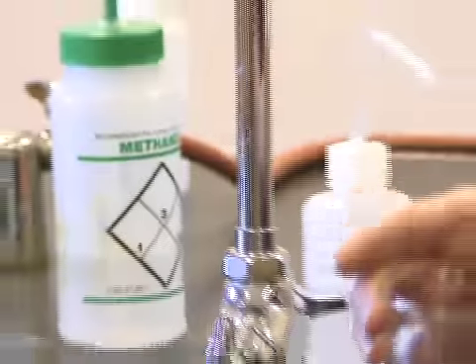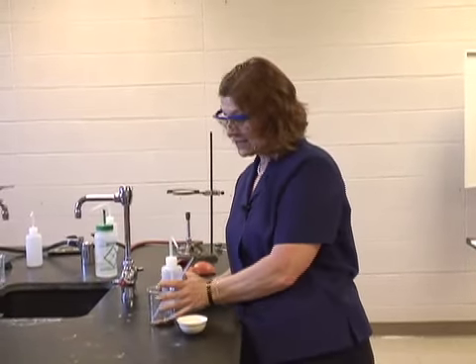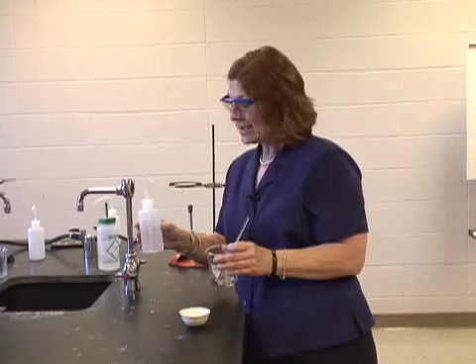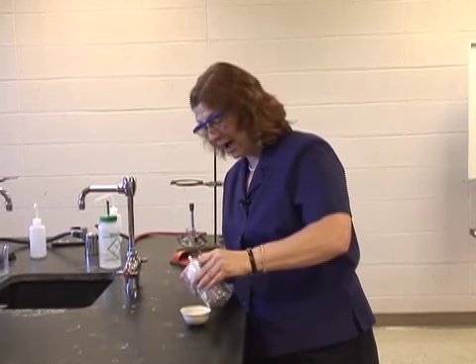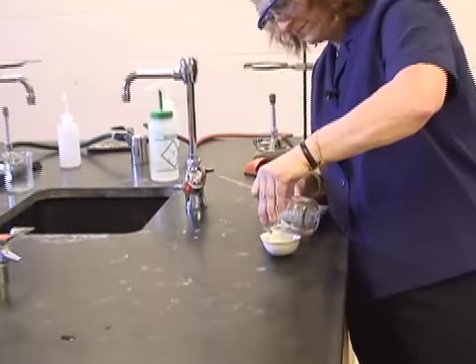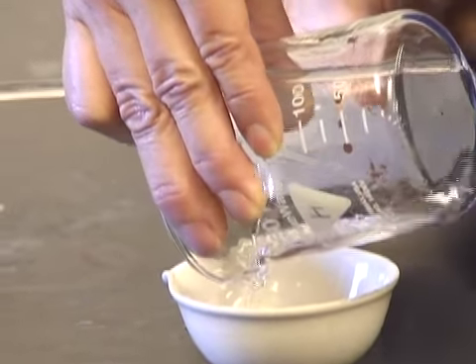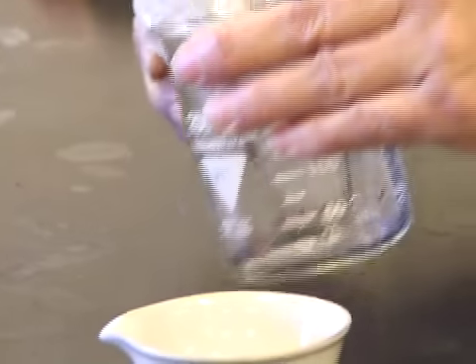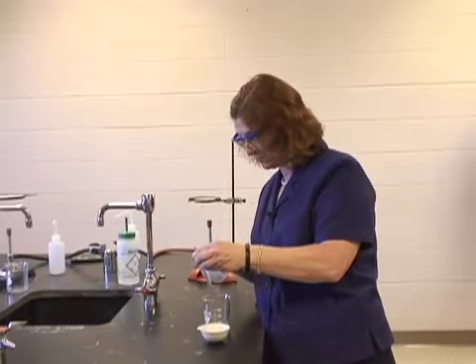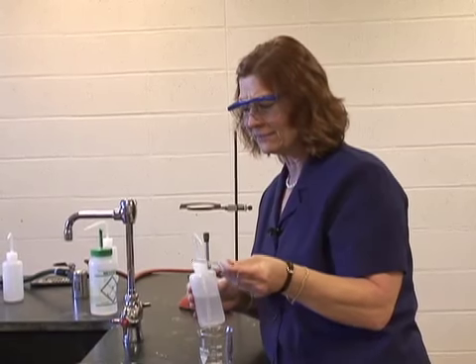And because we are going to be washing it with distilled water anyway, I'm going to use my wash bottle because the copper sticks to the beaker and is difficult to get out. So as I wash it, in order to get it out into my weighed evaporating dish, I will use the water here to get my copper out. And then I will also get the copper off of my stirring rod, because remember, we're trying to have the maximum amount of copper returning that we can.